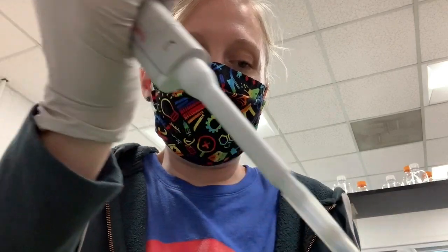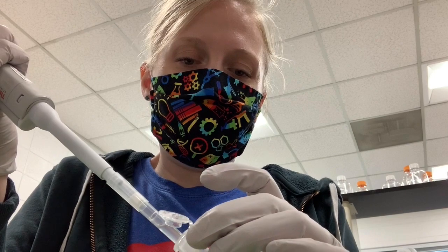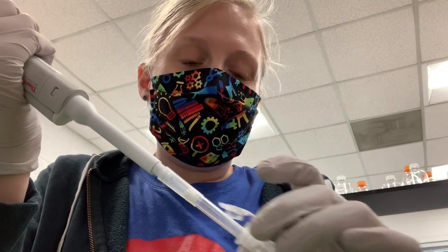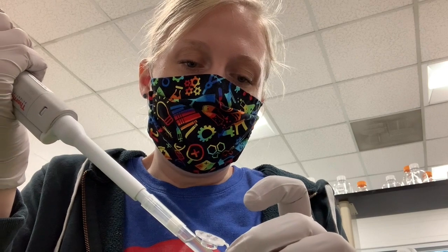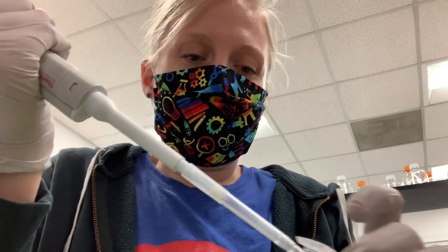If you can't see your pellet, you want to be a little bit more careful, and you might leave a little bit more of the liquid at the bottom in this first step. If you don't see a pellet at all in either step, that might be a sign that the double-stranded RNA synthesis didn't work. But you can keep moving forward, and sometimes there's a little bit of a pellet that you just can't see.